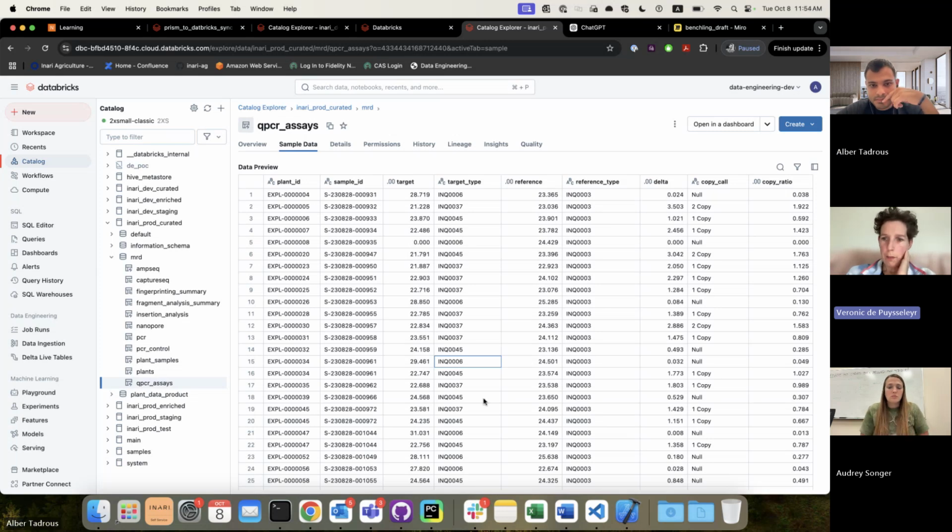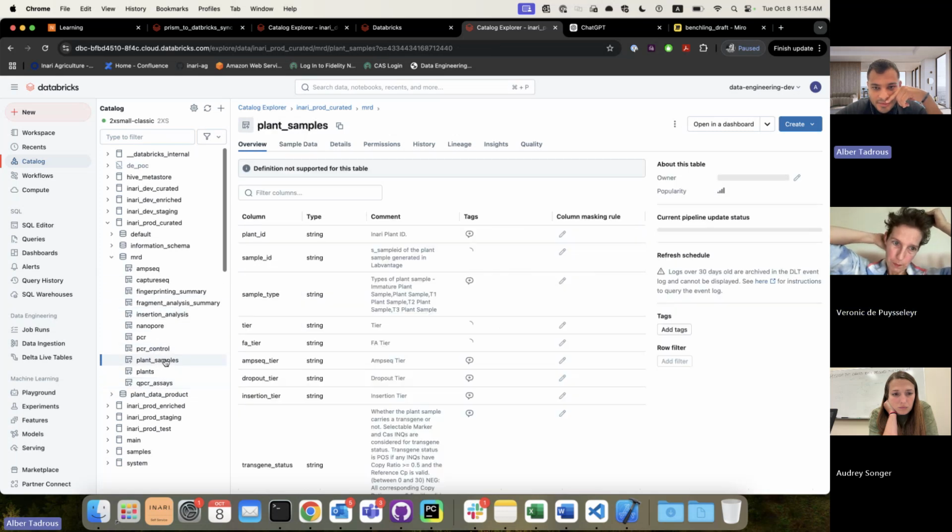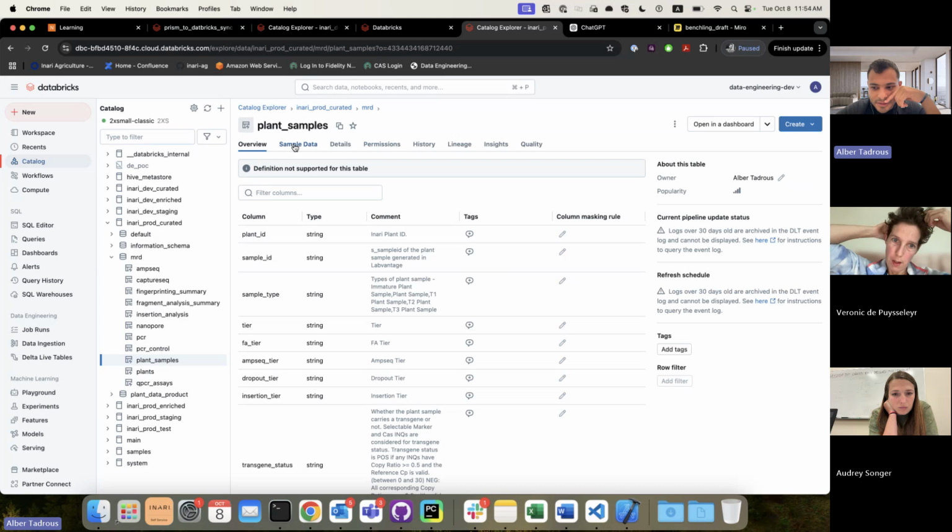I'm very confused by having those two fields in the plant sample, because what I would think is that you would link them on the plant. What are they doing there? I think the one on the plant sample is something like an indicator, to indicate true or false.